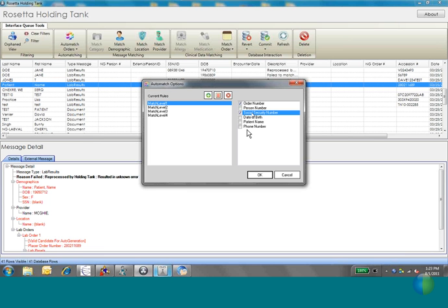So that might be one rule. Also, you could try order number, and then I have date of birth and patient name. So it has to match to all three, and then it'll match. Level 3, I did order number, date of birth, and phone number. And level 4, I just did order number and patient name. So basically, the more rules you create, the better, because you're giving it more options.